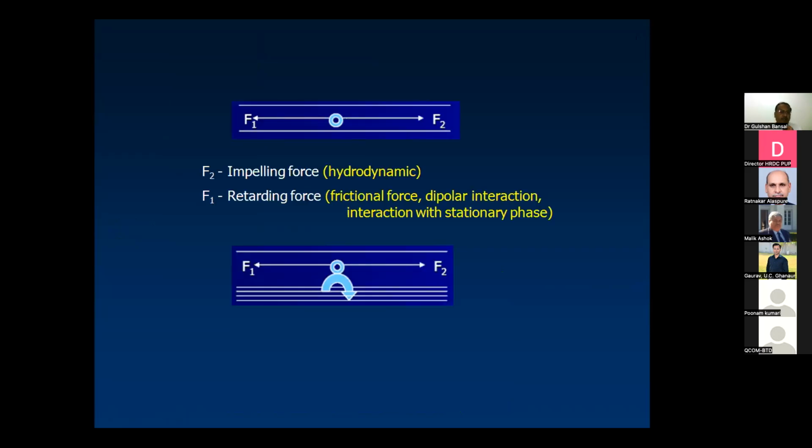So how are these components separated? The solute, which is organic in nature, is carried by the mobile phase. The mobile phase is pulling the solute in the forward direction, but at the same time this solute is adsorbed onto the stationary phase.